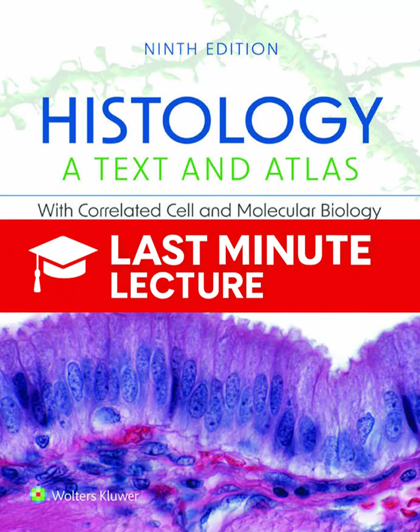You stressed earlier that every histologist has to overcome this 3D challenge. This is often the steepest learning curve for students. A histologic section is just a 2D slice of a 3D organ, and the way structures look can vary drastically depending on where you cut. Figure 1.11 uses the great analogy of slicing an orange. Right, a slice through the middle looks like a perfect circle. But a tangential slice near the edge might look like a crescent or just an incomplete shape.